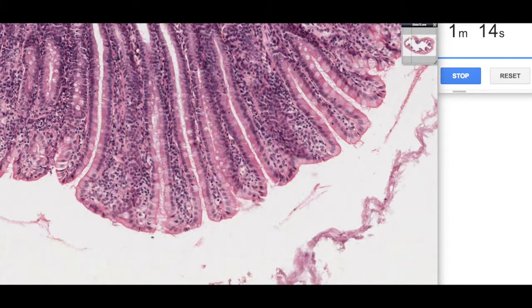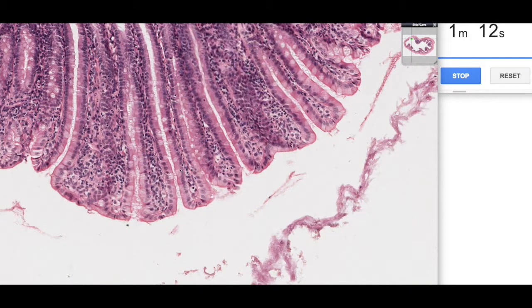If we zoom in, we can see that the epithelium is made up of two major cell types: largely goblet cells, which are secreting a mucus which is helping to lubricate the movement of the increasingly dry feces as it makes its way through the gastrointestinal tract, and we've got our enterocytes, which are responsible for absorbing water. And so that then removes the water from the developing feces, and therefore we need more lubrication, which is why we have so many goblet cells.